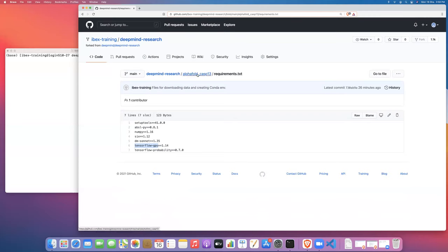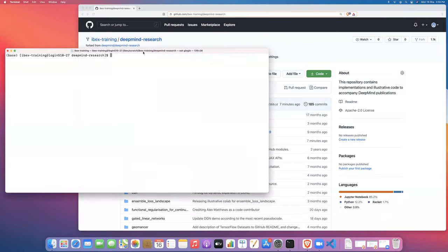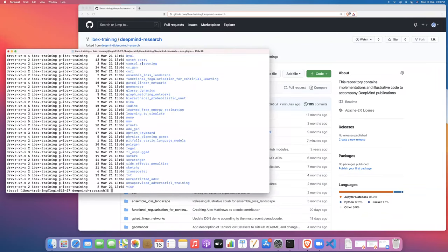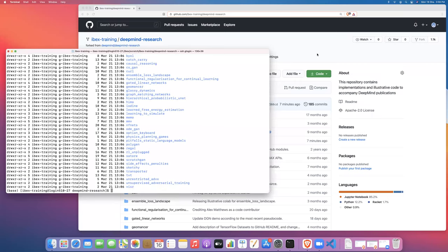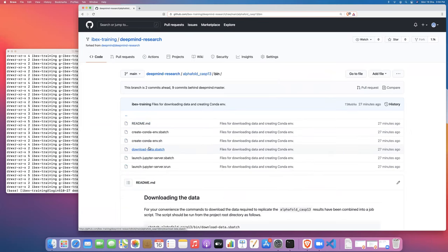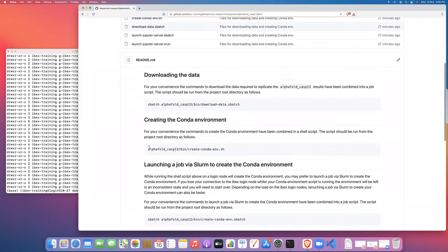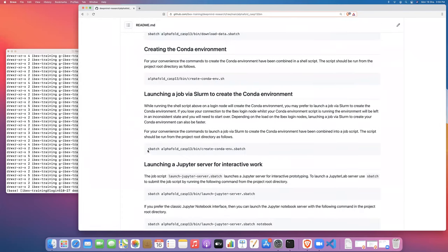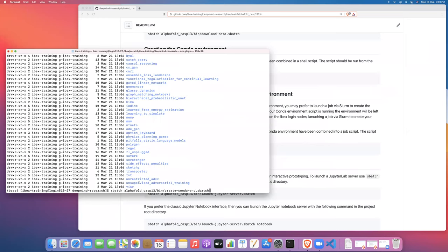Okay, so those are all the configuration files. Now let's create the conda environment. From within the DeepMind project directory, let's go back here to the actual readme instructions. We can run this command here, which will create the conda environment and do so as a batch job.